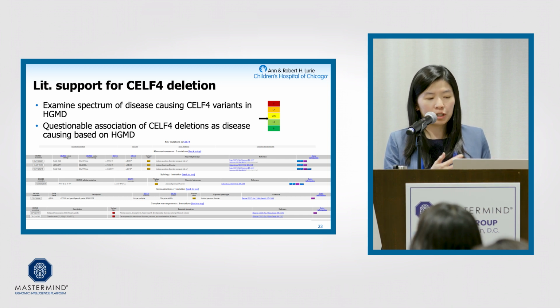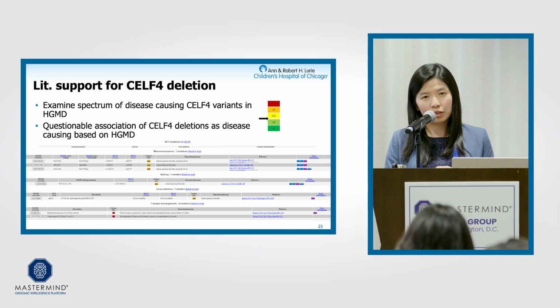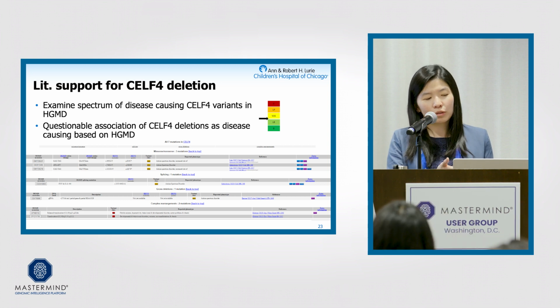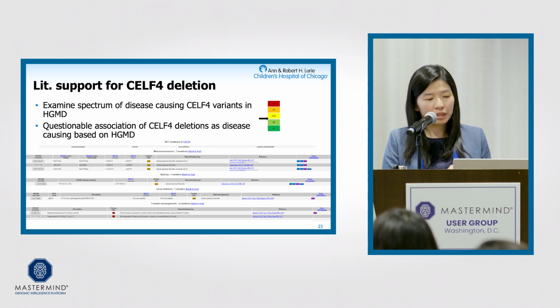So when we first look at it in HGMD, we have a case discussion every Thursday morning, and then we get together, our clinical geneticists, our lab directors, our GCs, analysts, and we do the interpretation for these CNVs that we see. So at first look, we were like, this is pretty weak, right? This is only disease-causing questionable, and then some people actually think, well, maybe we shouldn't even report this. There's no strong disease association for this gene, at least by HGMD standards. It's just not strong enough.